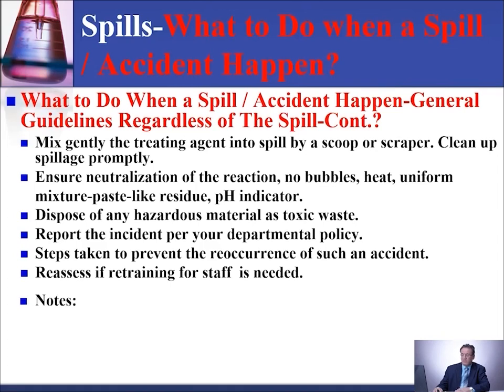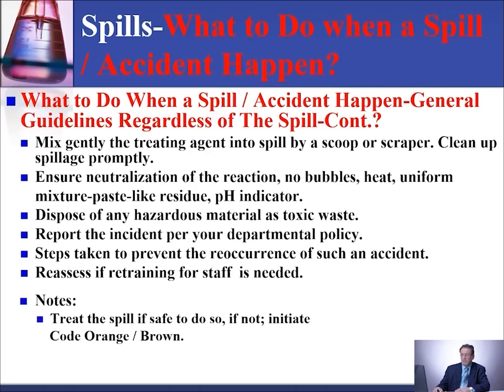Some notes regarding that: treat the spill if it is safe to do so. If not, initiate code orange or brown, or whatever code you use in your facility for such things. Messy workers are usually poor workers and they are the ones who cause accidents.